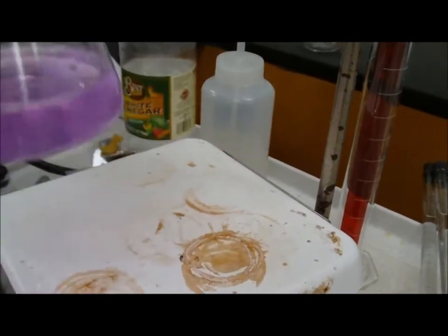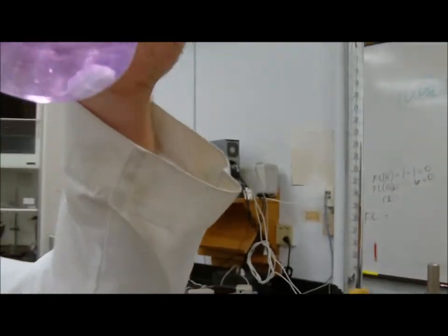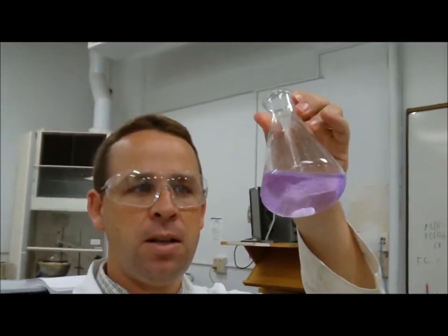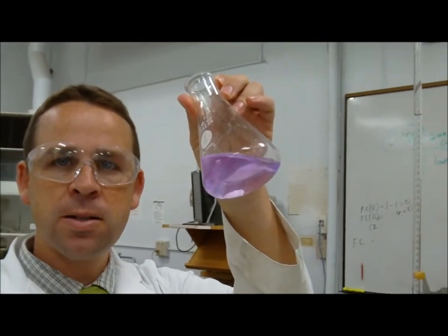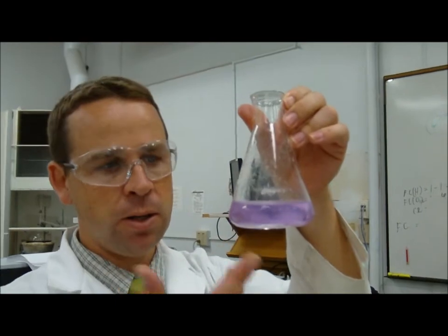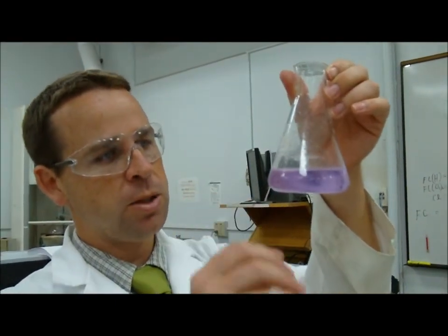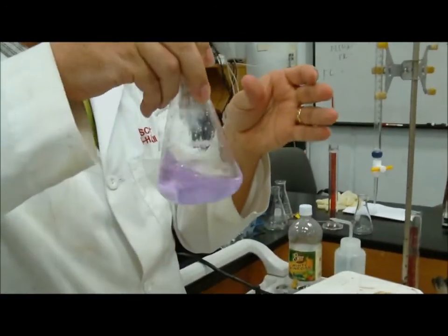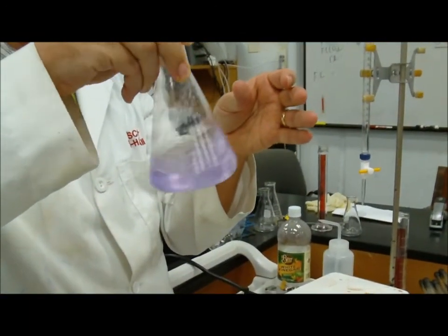So now the reaction is done, and you can see there's the pink color, but then there's also kind of a haze in there, a hazy color, and that's the copper hydroxide that is precipitated out and is floating around. And if I let it settle, it would settle down towards the bottom, right? So in this reaction here, let's see, is there a little bit more to go?